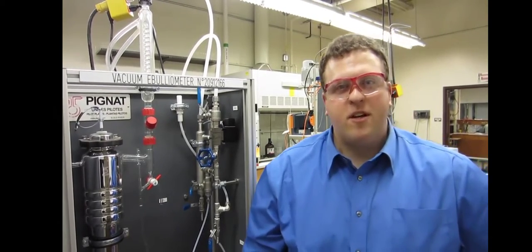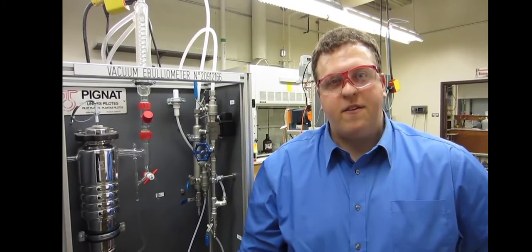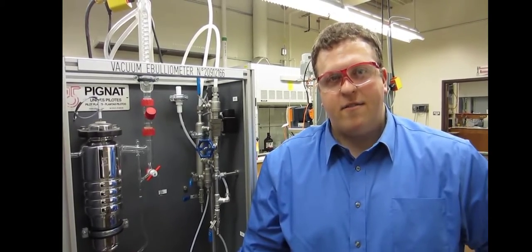All right, so with the experiment, we're trying to find some parameters for a vapor-liquid equilibrium. And with those parameters, we're going to find the Wilson coefficients for this mixture. And with those, we can find out how this will mix, and we can design a distillation tower off that data.